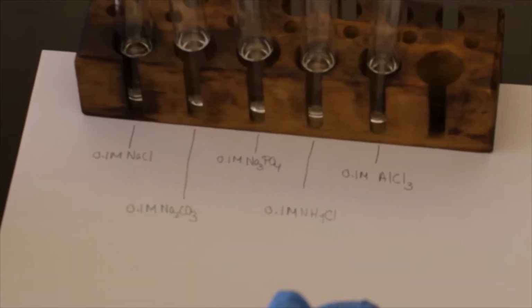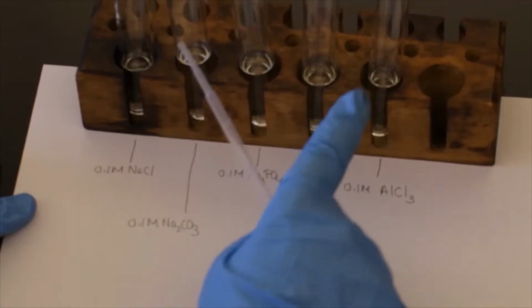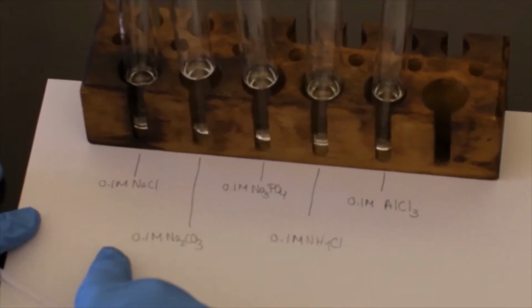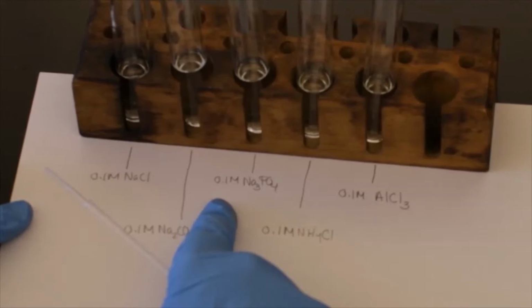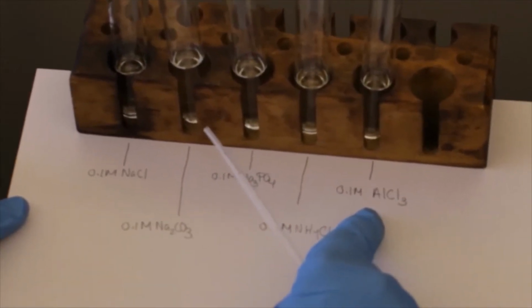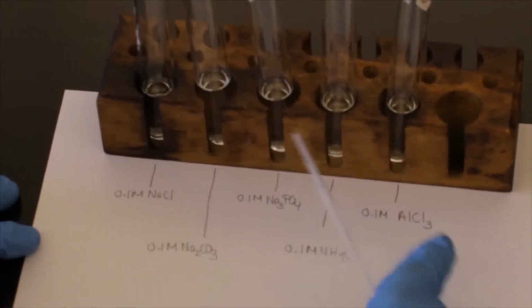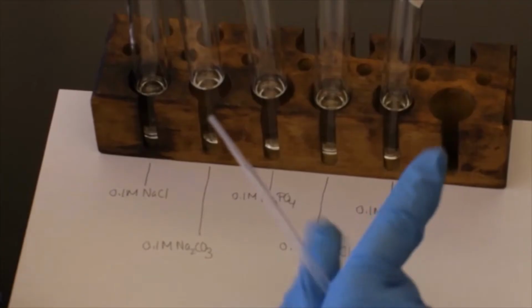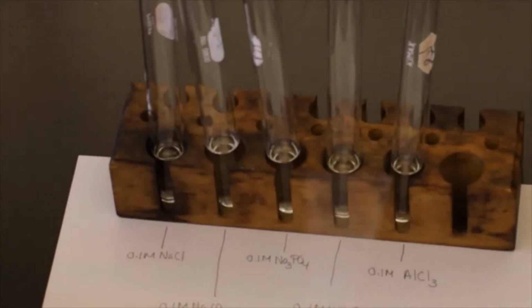This is part D when we're looking at the pH of salt solutions. We have various salt solutions set up in test tubes, so we're going to look at, for all of them are going to be 0.1 molar, but we're going to compare NaCl, Na2CO3, Na3PO4, NH4Cl, and AlCl3. And we're going to use what we call a universal indicator, which is a liquid solution that will change color. And you can compare this to the little picture of the universal indicator that I have listed in the lab folder.